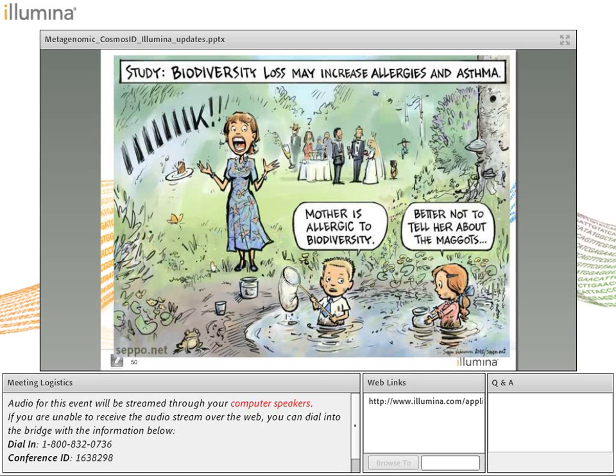Nice. There's another question that says, can you search the data to quantitate bacteria with a particular target sequence? So you already know beforehand what particular sequence you're looking for, and not a particular strain. Currently, as the app is implemented in BaseSpace, no, we choose the markers for you in order to do the best job of identifying the bacteria. You can't look for a certain subsequence that you particularly want.